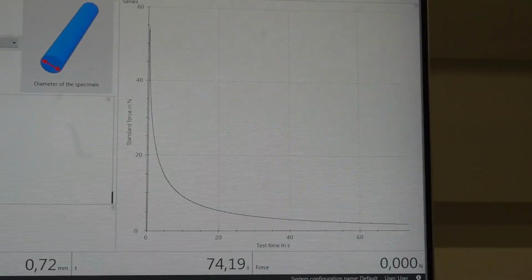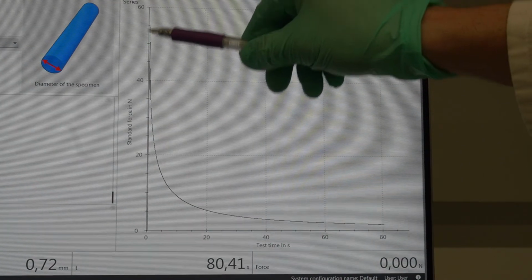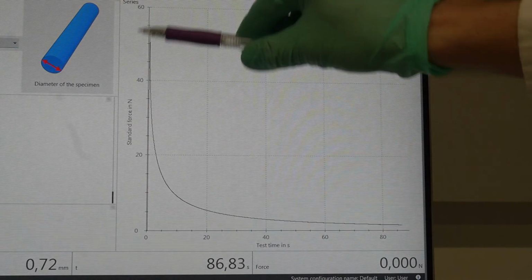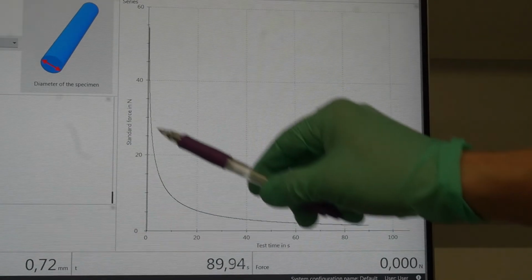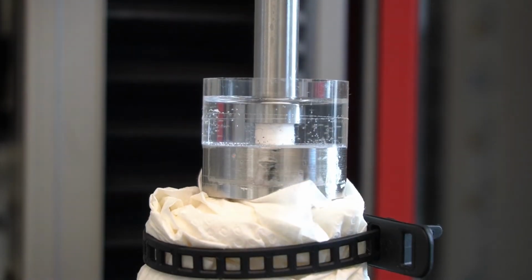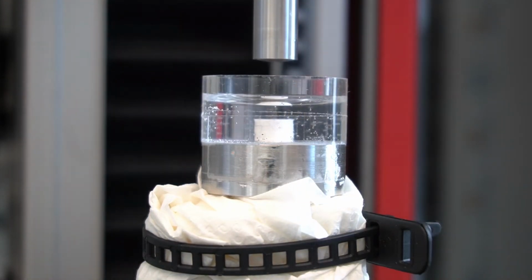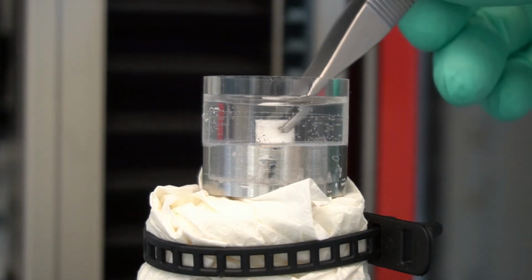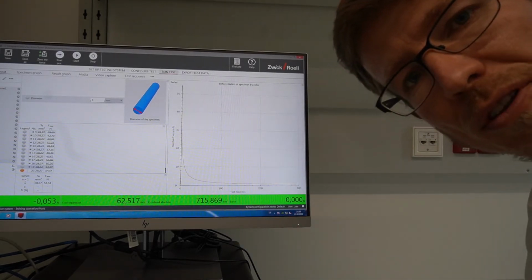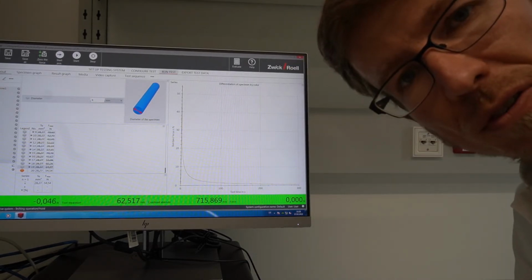And you see that the meniscus tissue is clearly viscoelastic, because for the same displacement, the displacement is always the same. It was applied at second 0 or 1, and then it stayed the same, but the force is dropping over time. The tissue is relaxing. Okay, the test finished. Let's get the sample out of there. So that was the test. A nice relaxation plot. And what you can do now is extract storage and loss modulus out of this relaxation curve by using the Prony series.